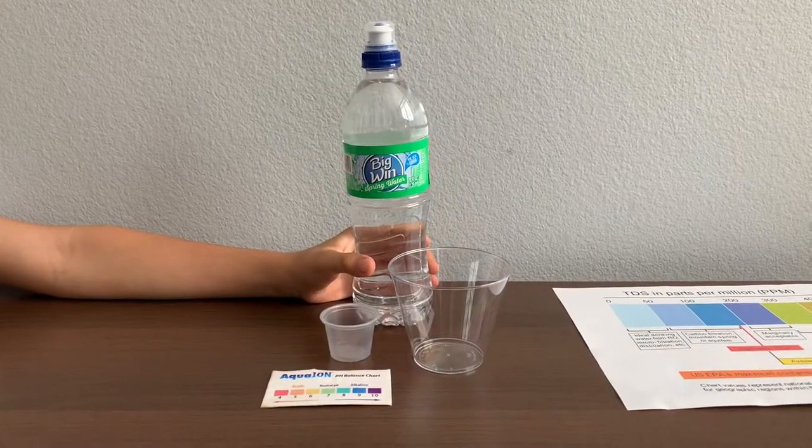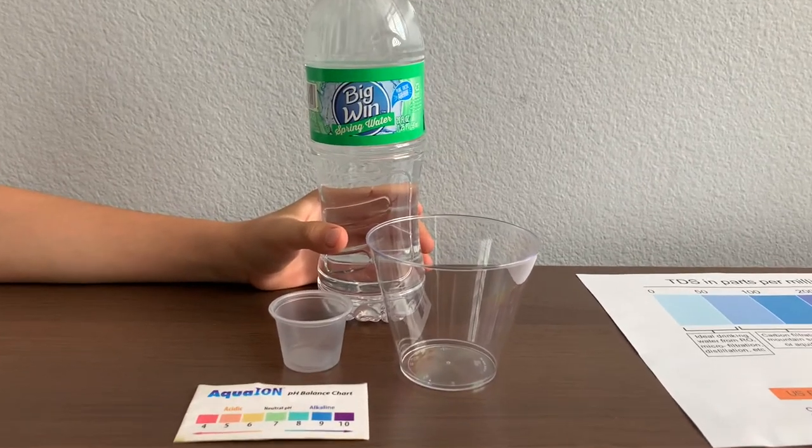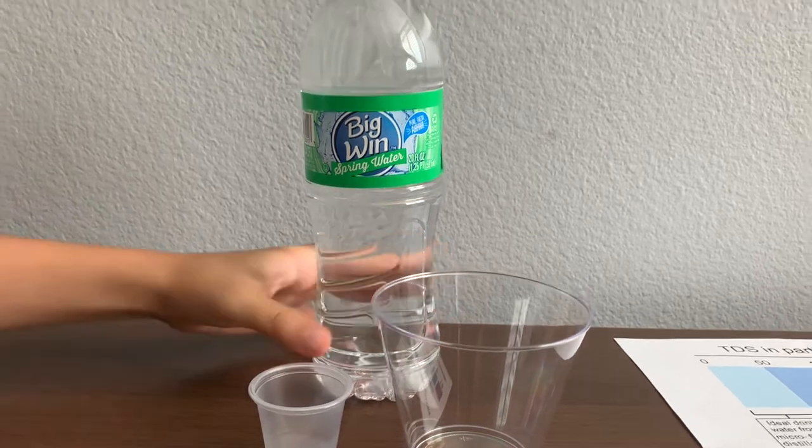This is Big Win Spring Water. It comes from protected springs and is distributed by Rite Aid Pharmacy. Let's test the pH and TDS levels.